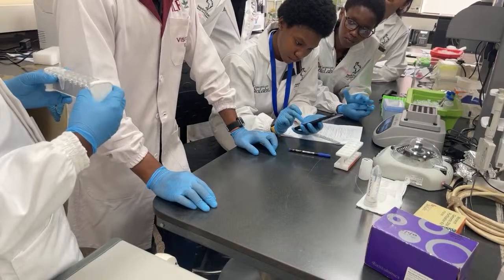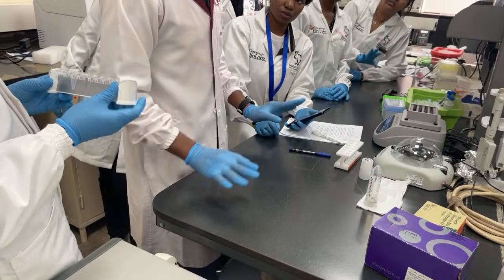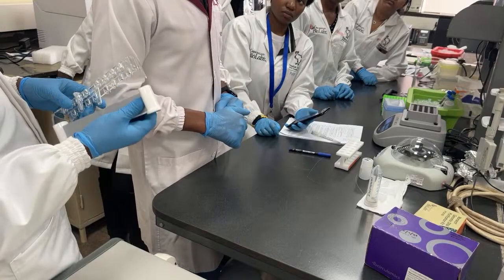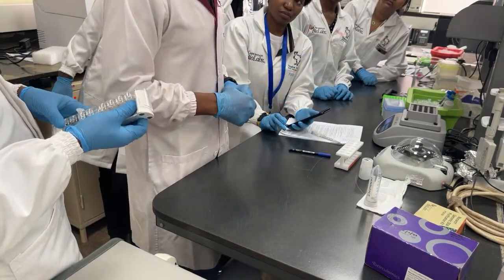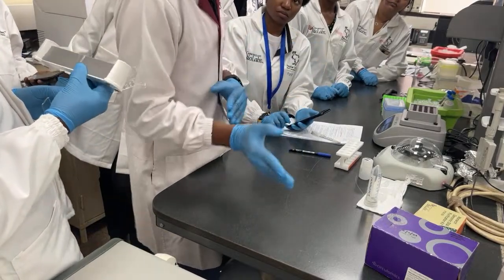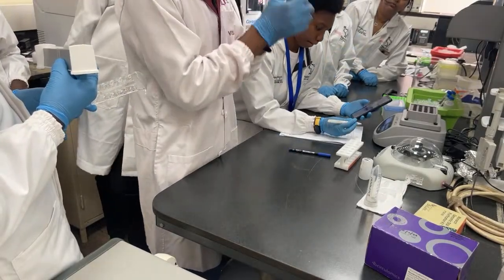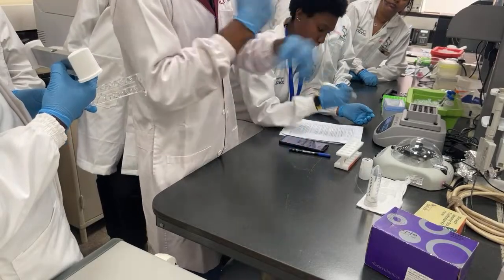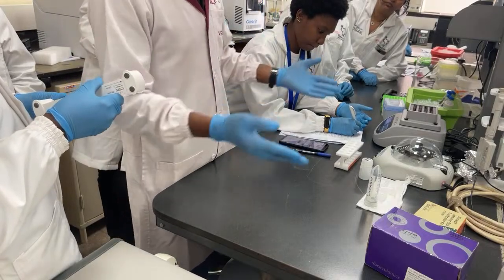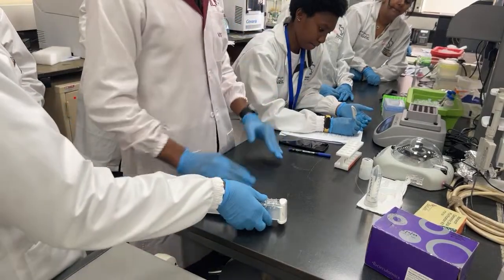Can you use the magnetic beads or the disc? No, this is purely for the disc. Remember, the beads don't capture the entire DNA, they just capture a subset of the DNA based on the ratios you're using. Here we are separating the entire DNA from all the solution, so you need a disc that the DNA wraps around. When we do our library, that's when we'll do the washes with the magnetic beads.